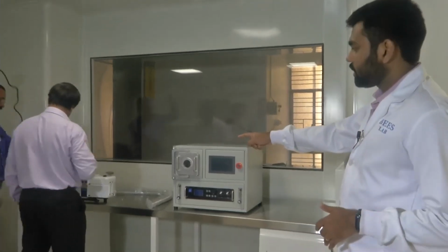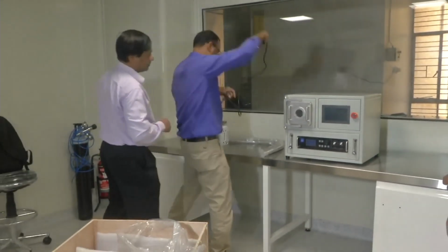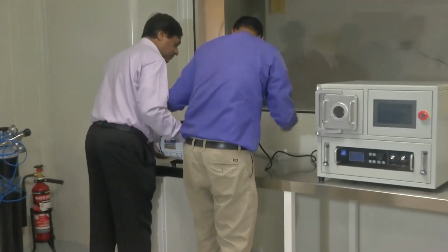So the next one there is the vacuum system. He will connect the vacuum system to the chamber.